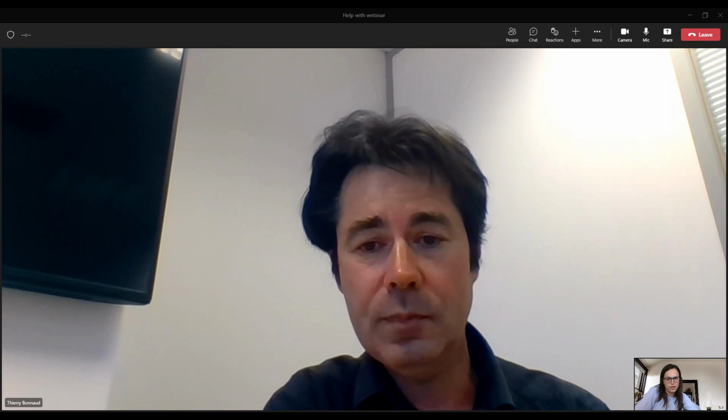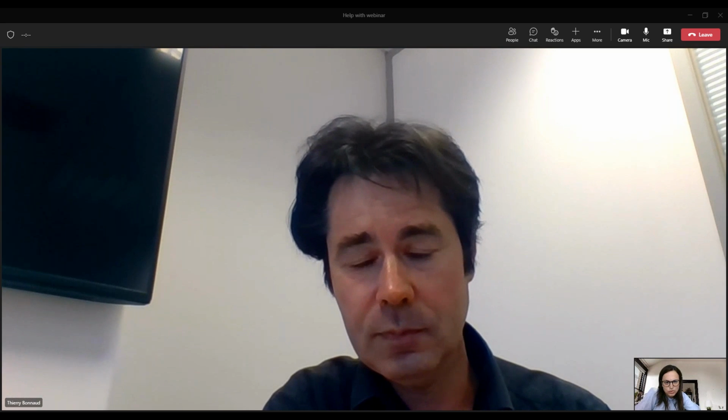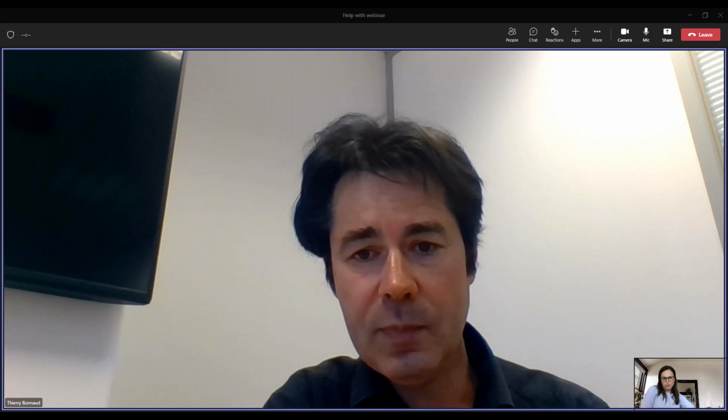Okay, thank you. Another question is related to the co-formers. Do we have to give the co-former as a drug? I guess the question is whether the co-former also has activity. What do you think about that?